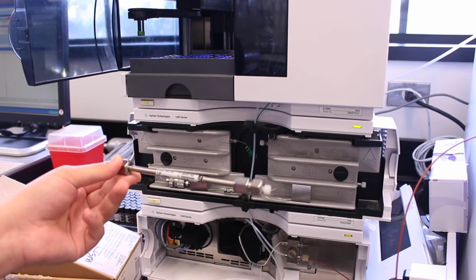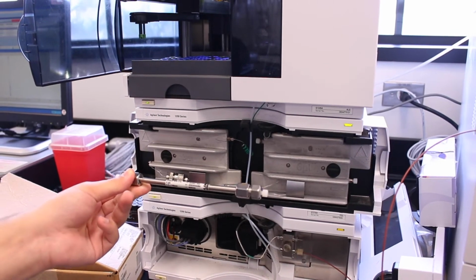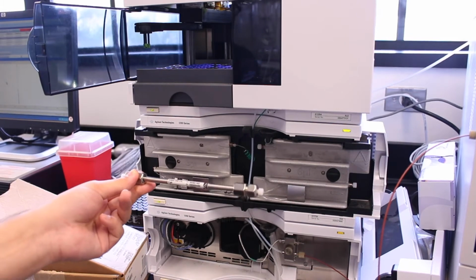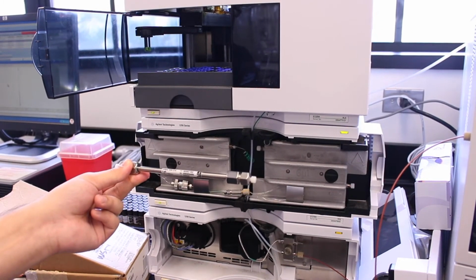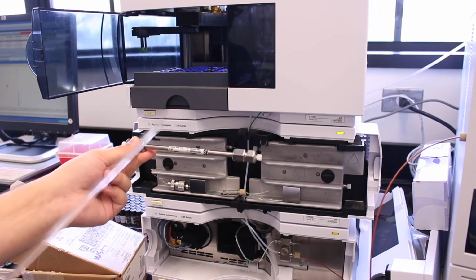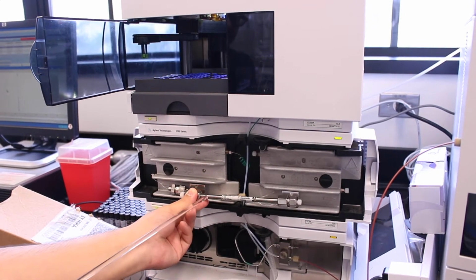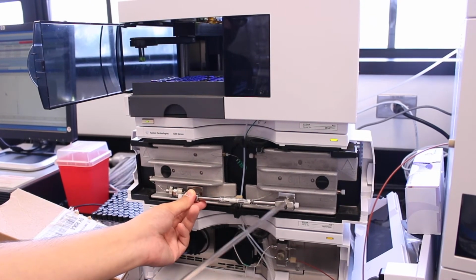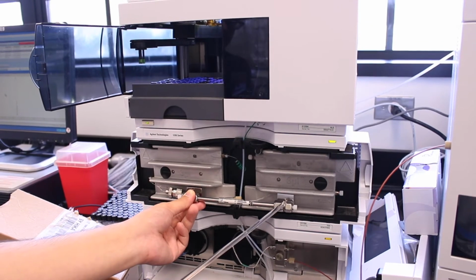As opposed to a GC column, which is perhaps 20 to 30 meters in length, so it's quite long and thin, an LC column is very wide and very short compared to it. So in here is a stationary phase, like in TLC, and that stationary phase is going to separate the mixture as it's being pumped through it. So the mixture will enter, say from the left side, like right here. It will travel down the column and it'll be separated, separated, separated. And then you'll have pure compounds, pure molecules exiting at this side of the column.